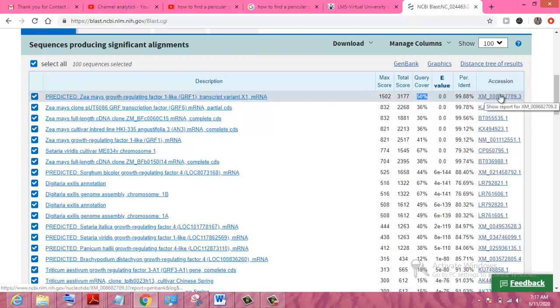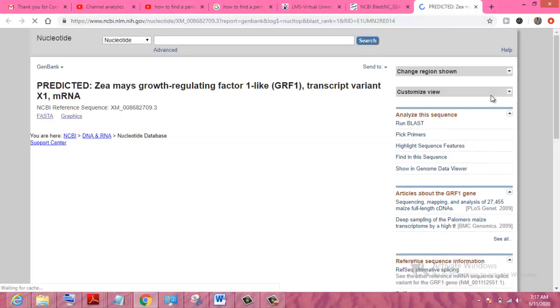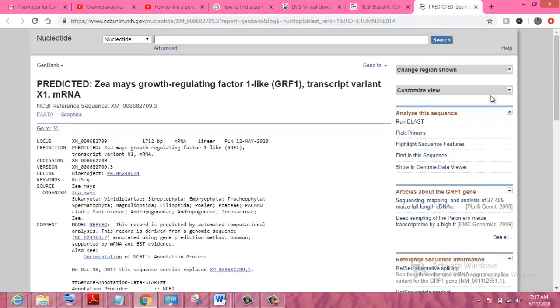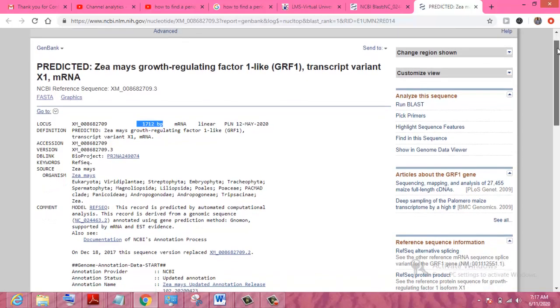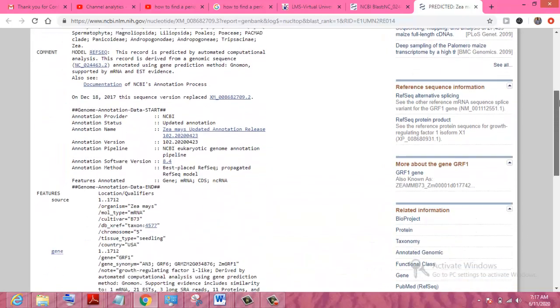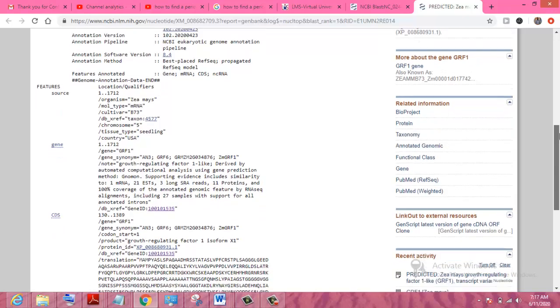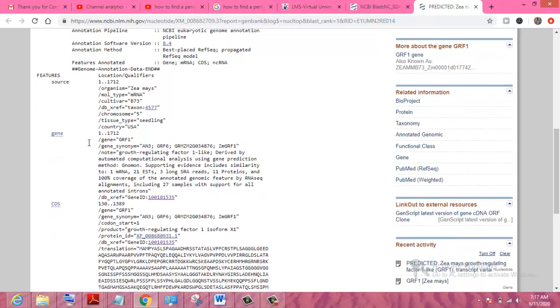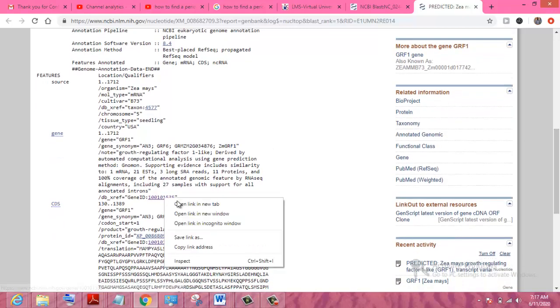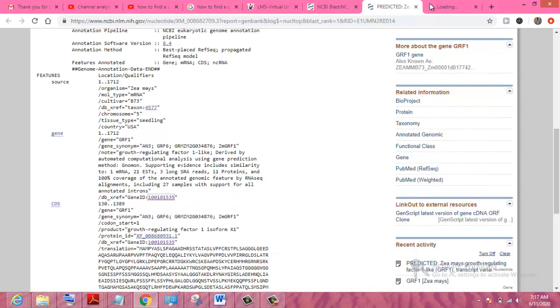We select the accession number here and click on it. A next window will appear. You can see this gene has 1,712 base pairs and this is the gene mRNA. You can search this gene's protein here. Opening this gene, you can see it is the first predicted gene which we wanted to search in NCBI.